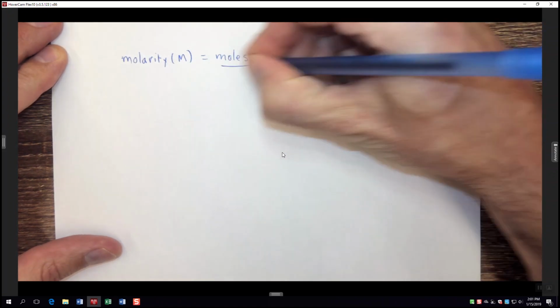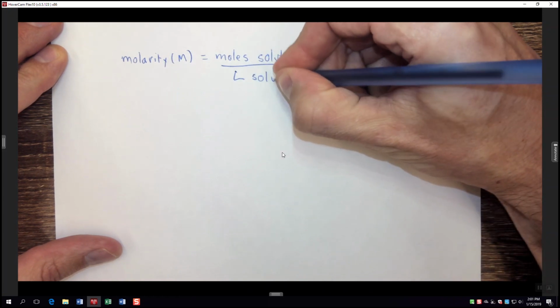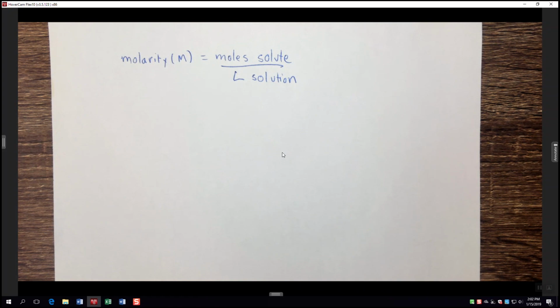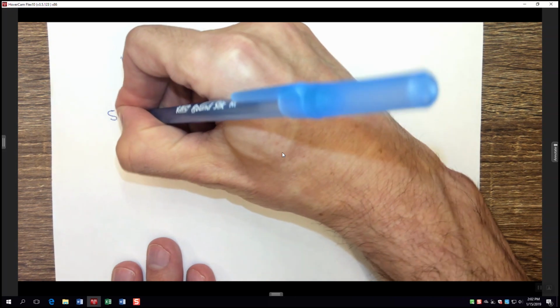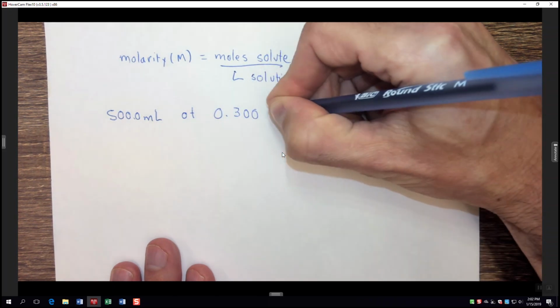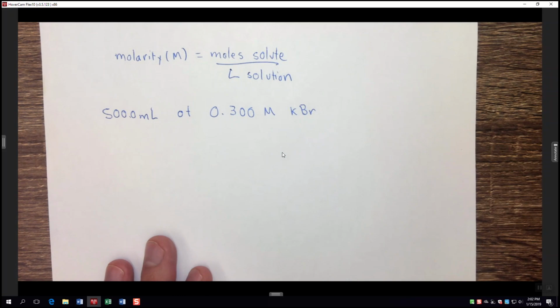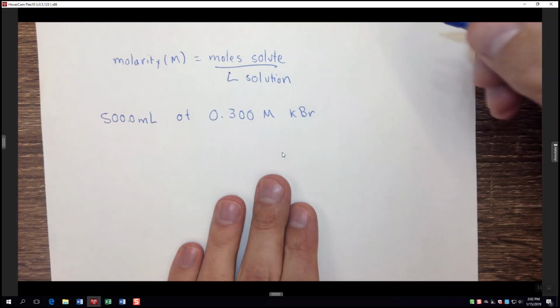In this case, they range between about 0.01 molar, a little bit less than that, to around 0.05 molar right here. And we're going to measure the conductivity of these solutions using a MicroLab and a conductivity meter. As the concentration of the solution increases, so does the conductivity. We can then do a linear regression in Excel and get y equals mx plus b, the equation of this line. If we then measure the conductivity of an unknown solution, we can use this equation with a y value to solve for x and determine its concentration.